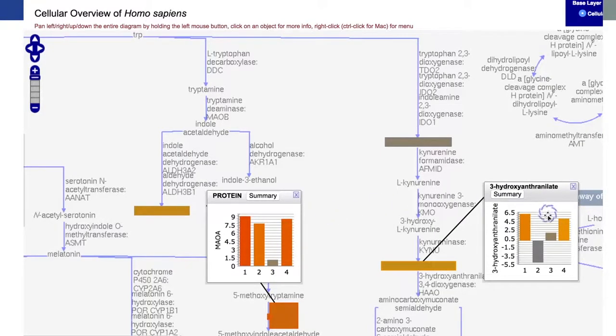And for this particular metabolite, so here we're actually looking at metabolite and gene expression data together, because for this tool, unlike the dashboard currently, we can combine transcriptomics and metabolomics data into one data file. Essentially, each line of the data file will contain data for either one gene or for one metabolite.